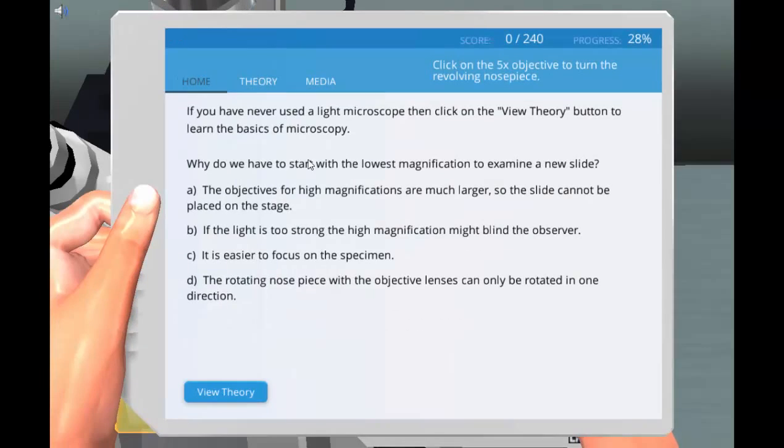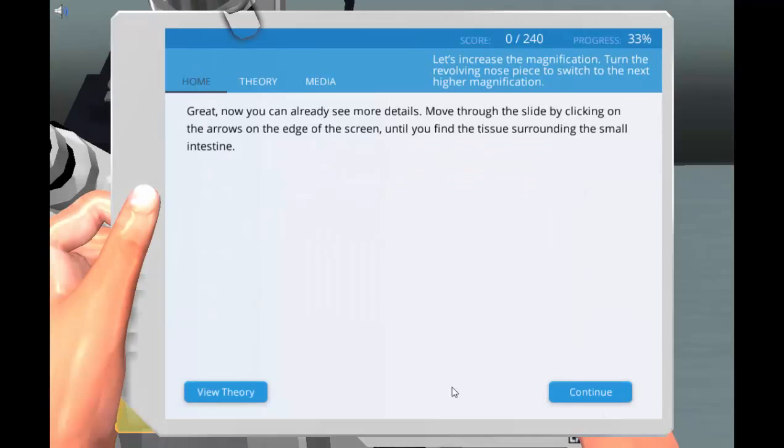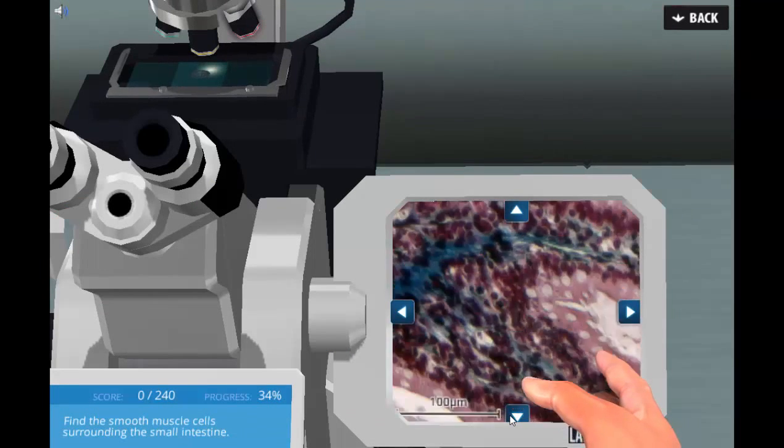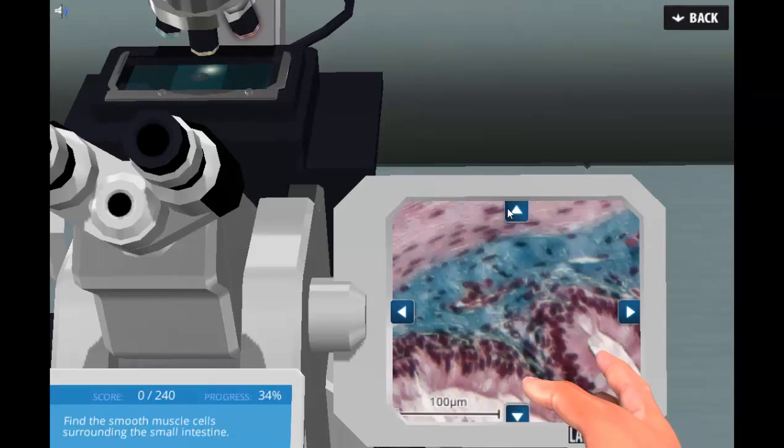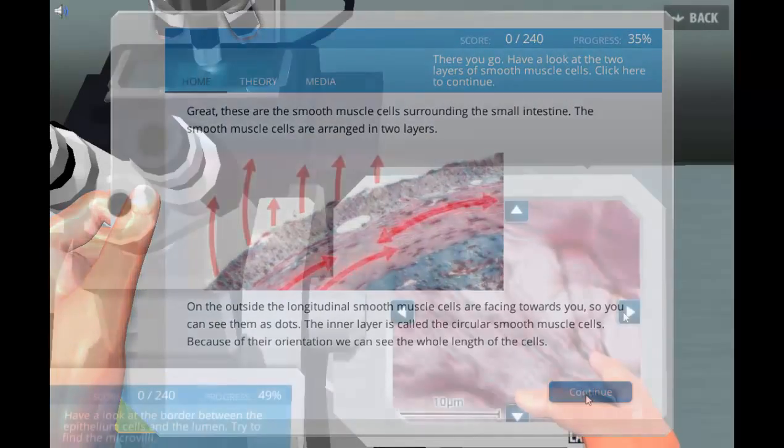Using the five-power magnification, students identify the villus and then proceed with higher magnifications to identify smooth muscle, extracellular tissue, epithelial cells, goblet cells, and the nuclei.